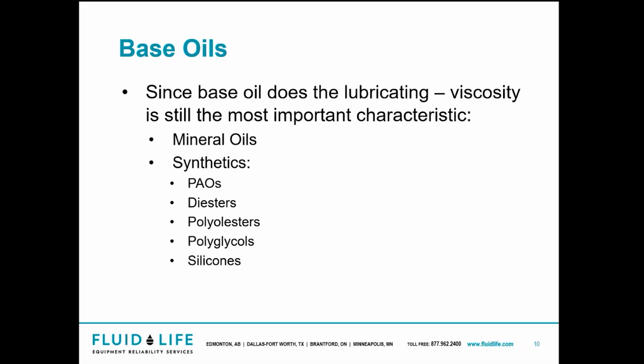Now, since base oil does the lubricating, viscosity is still the most important characteristic. For anyone who's done any of our other little courses or attended any of our training seminars, I usually have viscosity bolded, underlined, capitalized, in larger text to indicate viscosity is probably an important characteristic for a lubricant. Same thing applies when it comes to your greases. Viscosity is going to be paramount. You can use mineral oils or a variety of different synthetic oils as your base oil.